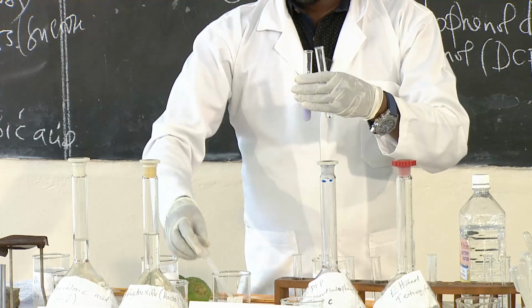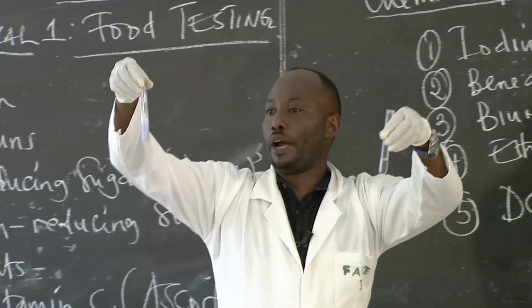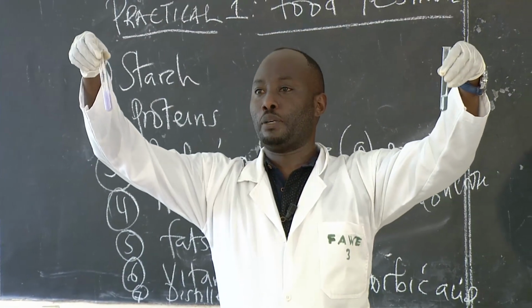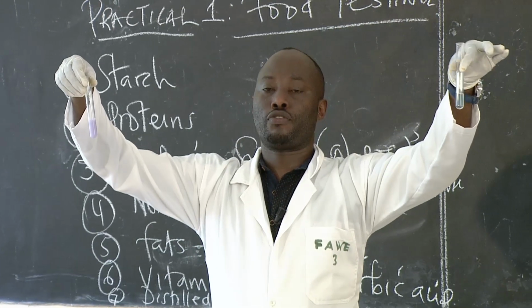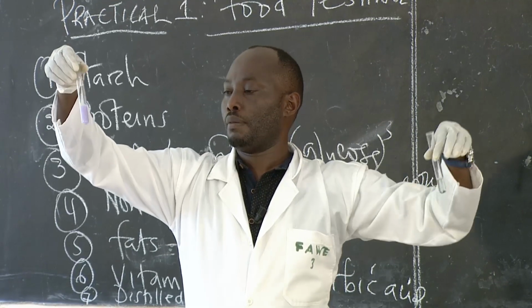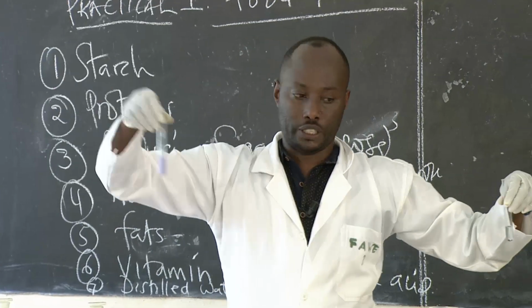Okay. You can see there are 2 things from here. The white milk that we are used to seeing, does the milk contain proteins? So from here, I can say, here the color of Biuret persists, which is a blue color, but here the milk turns into purple, which indicates the presence of proteins.